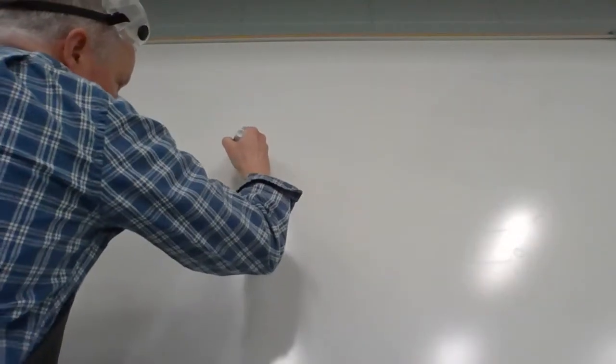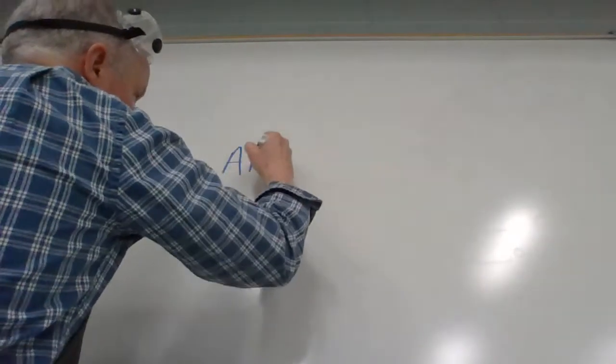So I thought we'd do a lab today. But first, let's look at different types of equations, and then we'll start our lab. All right, so this is a general form of equations. We just use A's and B's and C's and D's rather than the elements. And so one type is like this.